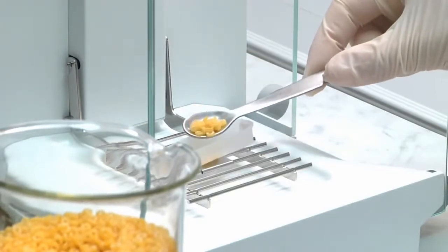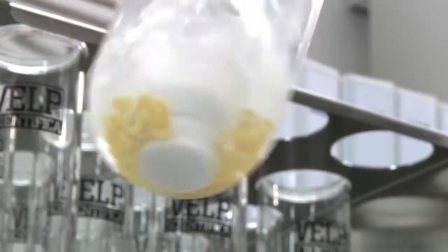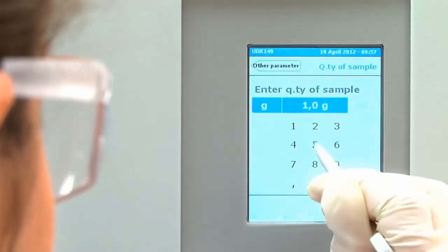Kjeldahl analysis is ideal for solid, semi-solid and liquid samples. Accurately homogenize the sample, weigh and transfer it into a VELP glass test tube according to the official method.